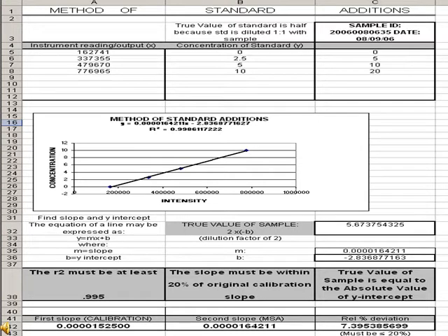Here is an example of an Excel spreadsheet from a non-commercial laboratory used for samples analyzed by MSA. They have placed the intensity counts on the horizontal axis and the concentration on the vertical axis, but the final result is still the same since the line will intercept at the vertical axis where the concentration is. For this example, it was negative 2.83, or calculated as 5.67. They have also included the criteria specified in the SW846 applicable methods of meeting less than 20% RSD from the slope of the original calibration curve using the same standards and the calculation for concentration.